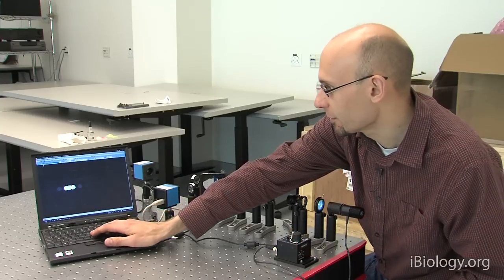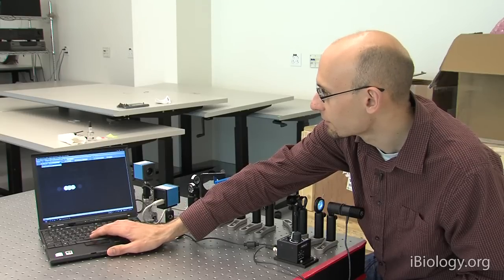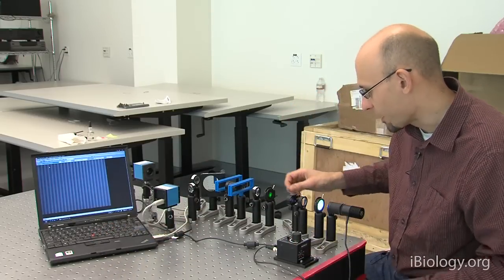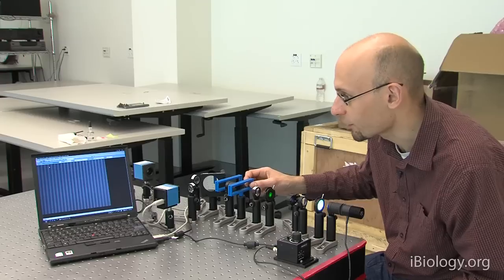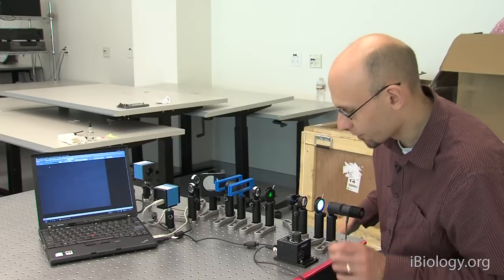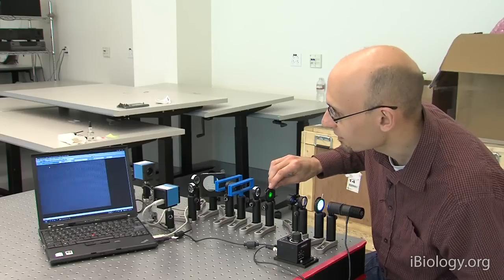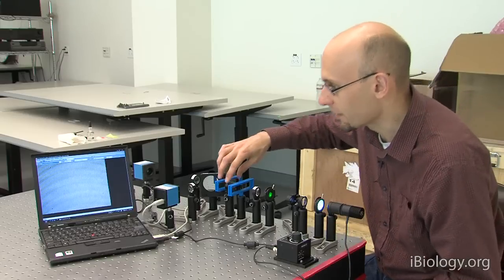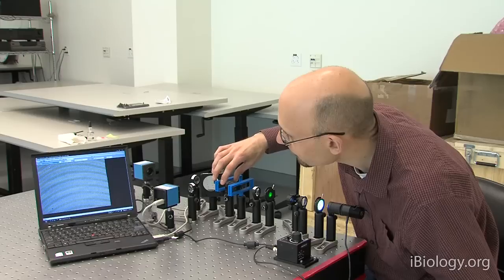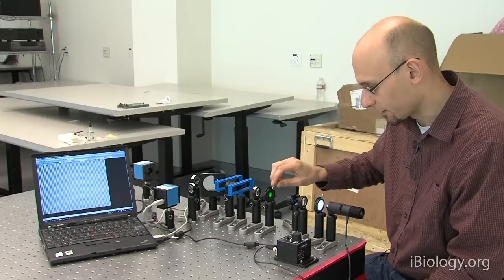OK, let me switch back to my image camera here. So again, here's my grating image. And now I have many different gratings printed on this slide, so I can just slide over here. And now, if you look at this grating, let me make it a little brighter. You can see that this is a very fine stripe spacing grating. So you can see here that the lines are much more closely spaced together than in the previous grating.